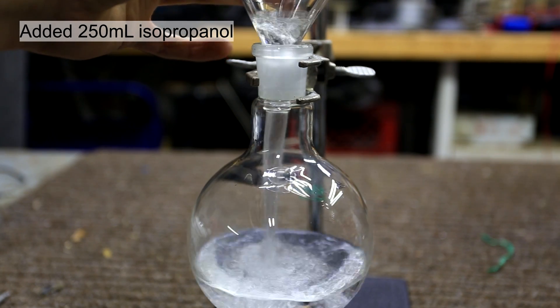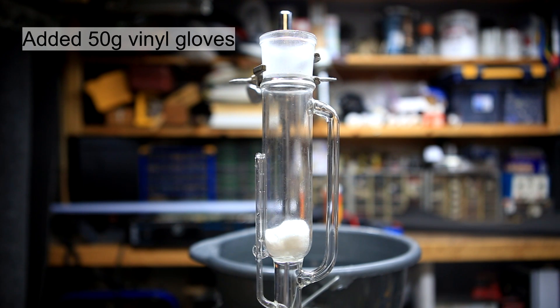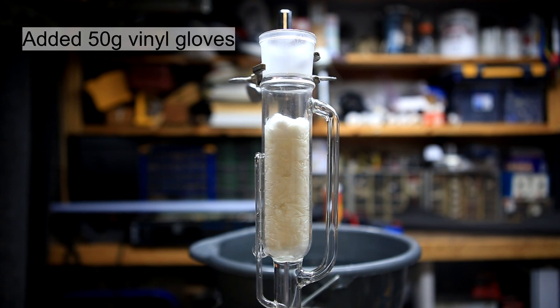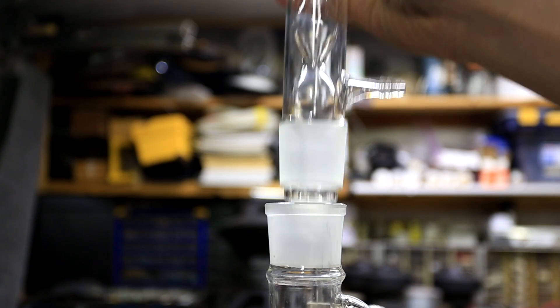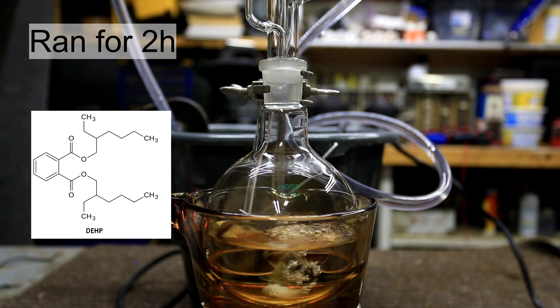250 milliliters of isopropanol was added to a round bottom flask. A Soxhlet extractor was then loaded with some cotton followed by 50 grams of cut up vinyl gloves. The gloves were cut up into small pieces using a pair of scissors. A condenser was added to the top of the Soxhlet extractor and the water lines were attached. The extraction was allowed to run for two hours.